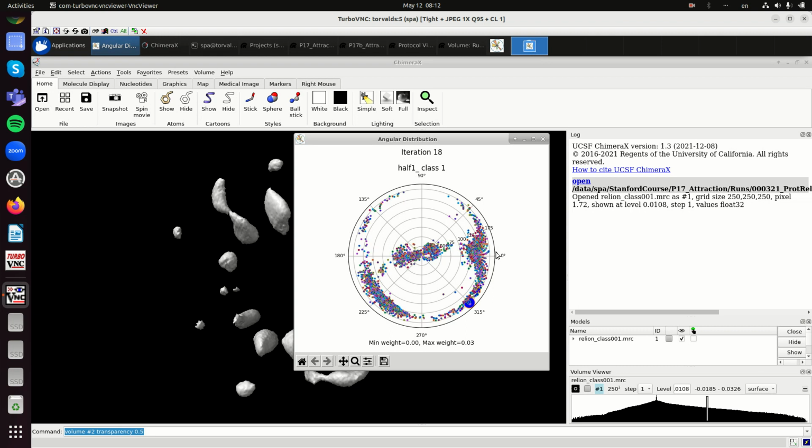So let's say that you start averaging, in the 2D class or in the 3D reconstruction. You assign more particles in one direction, so that when you average in that direction, the background becomes smoother because you are averaging more. So when you compare the background of an experimental image to this smoother background, you will have a lower contribution because the background doesn't change too much, and then this difference doesn't change too much either. So the variance of the comparison will be smaller, and then there is a kind of variance barrier that the signal has to overcome to be assigned to the correct position, to the correct orientation.